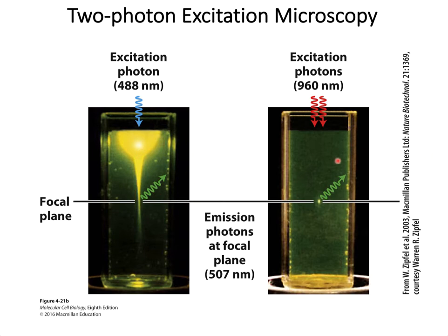But as you can see on the right, the 960 nanometer near infrared wavelength is beyond the visible spectrum with no background scattering of light. The advantage of two-photon over conventional confocal microscopy is that this technique can focus the two photons much more precisely, in a femtoliter volume, on a focal plane with almost no undesirable excitation outside the focal plane.